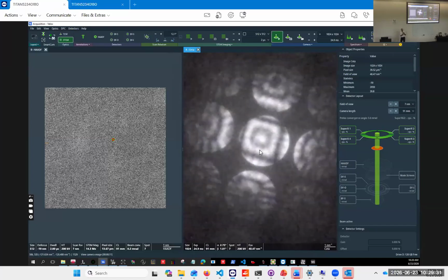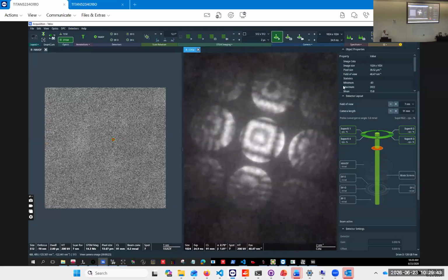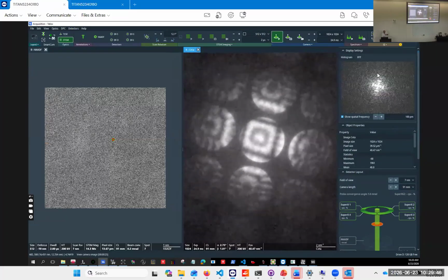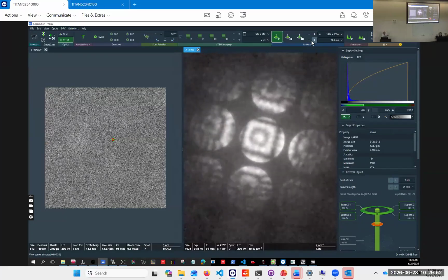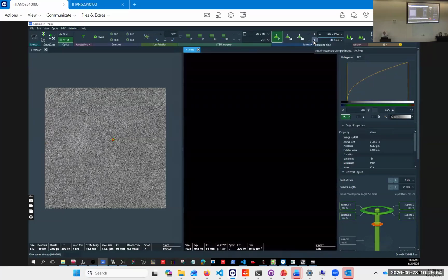There are a lot of features now in this convergent beam pattern, and the very obvious ones are the excitation errors, right? The excitation errors, I can probably do that a little bit and do it slower.